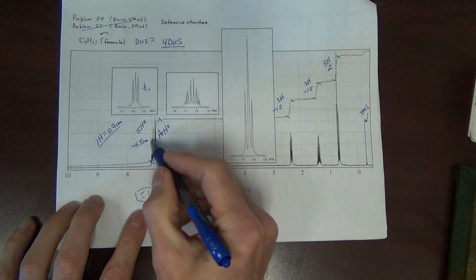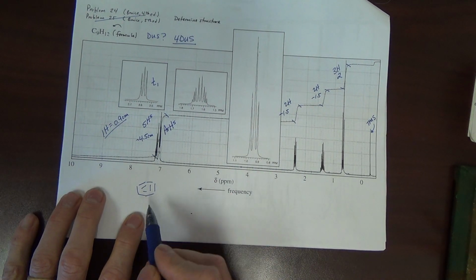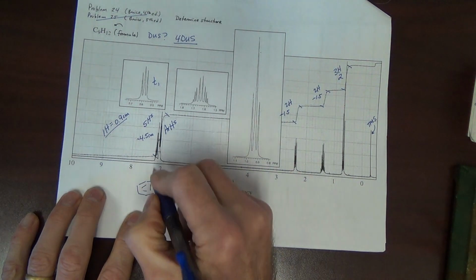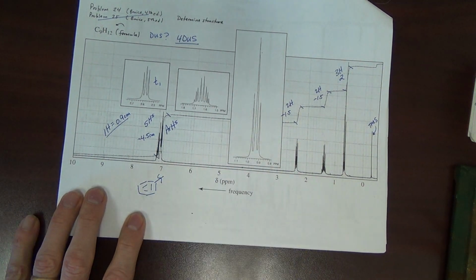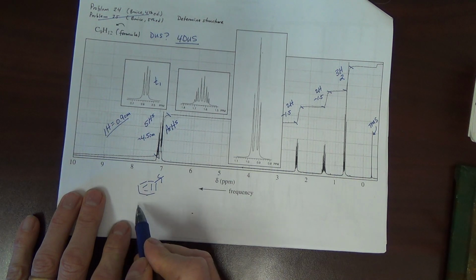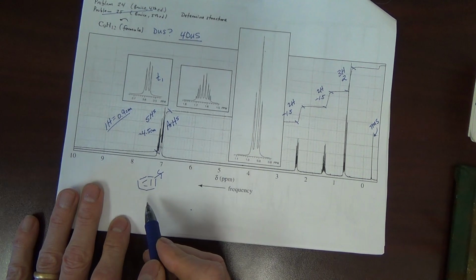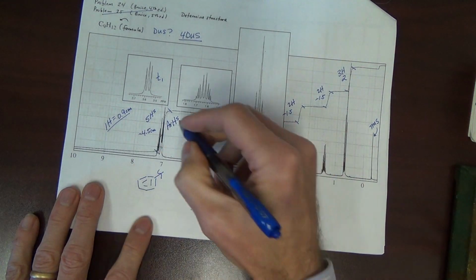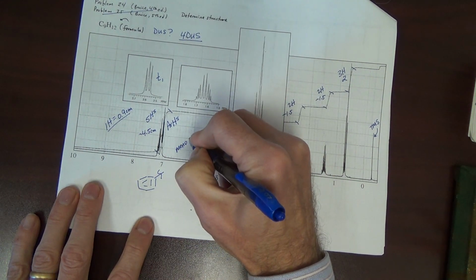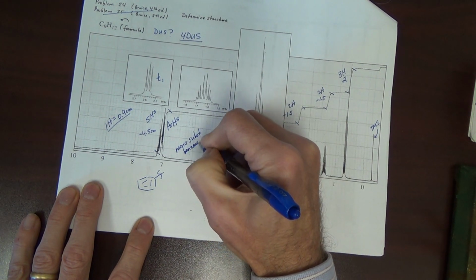Now, if there's 5 aromatic H's, that means there's 5 H's on this ring. Importantly, that means there's just one substituent, or non-H. This leaves 5 H's on the ring. 1, 2, 3, 4, 5. Okay? This tells us we have a monosubstituted benzene ring.